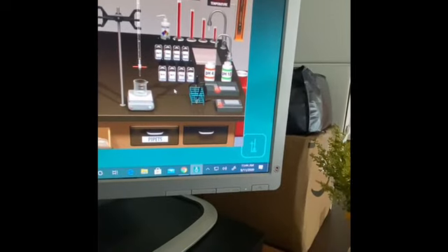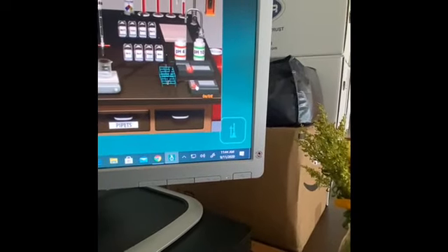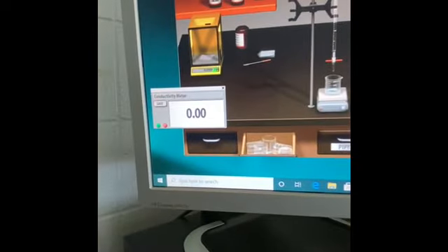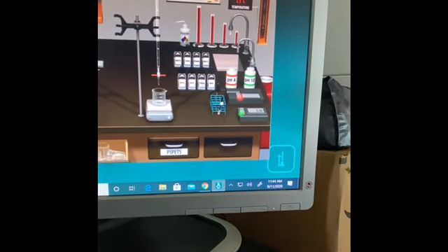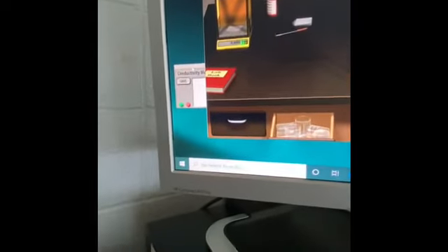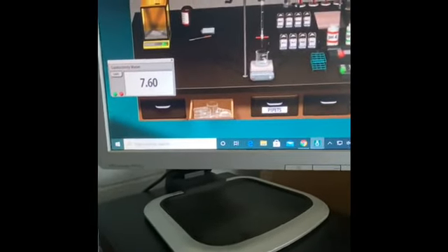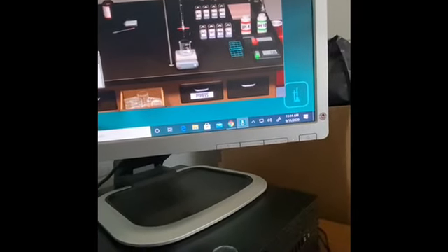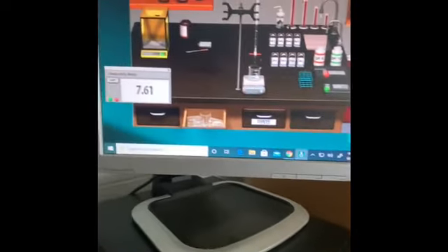Now we turn on the conductivity meter located on the lower right hand side. So this is the conductivity meter, right where the red button is. Turn it on and up comes this little screen. Now we go back and we take the conductivity probe, it's the first black stick, and you stick it in the beaker. And now this went behind, so I got to bring it back and forward. And see, this is the conductivity of the water plus the NaCl. You're going to record that in your data table on the electronic document we sent, where you create a copy.